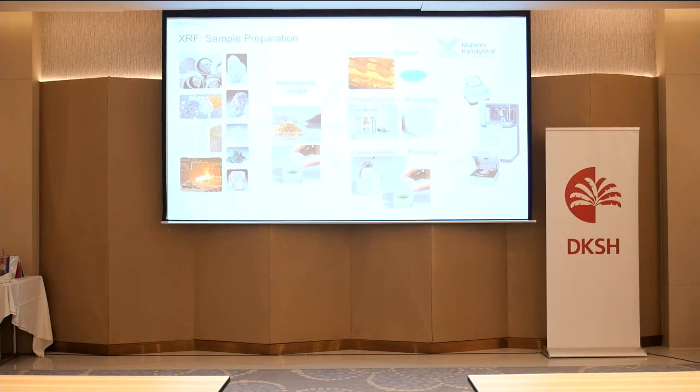Also, when you have powder, you can prepare it in different ways. You can measure it as a loose powder, as a pressed pellet, or you can fuse it as a glass bead and then measure the glass bead. The liquid sample, of course, you can directly put into the sample cup and measure. And then you put it in one of the XRFs.